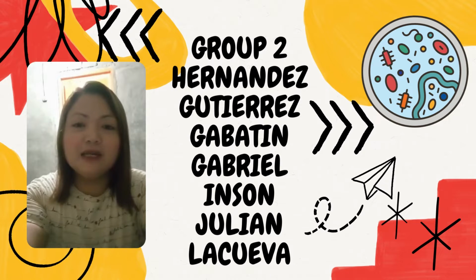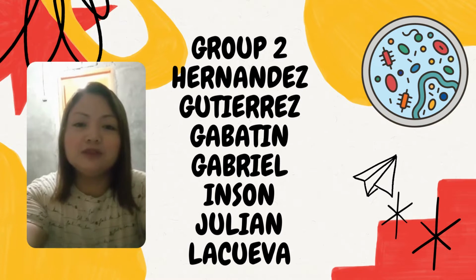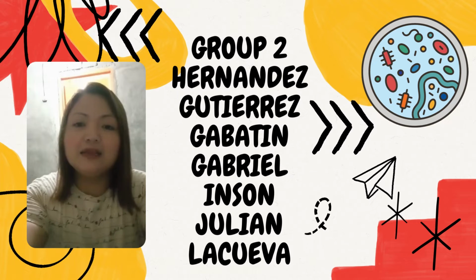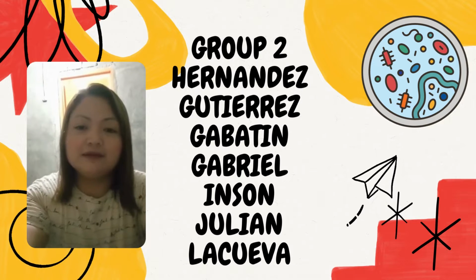Before we begin, let me share with you our learning objectives. At the end of the laboratory period, the students should be able to perform the gram staining procedure, identify the gram staining reaction, and distinguish the fundamental shapes of bacteria.